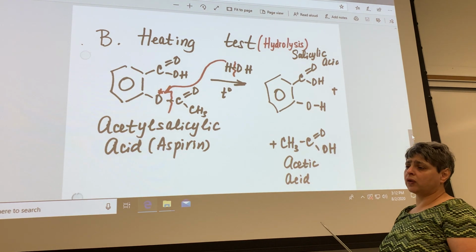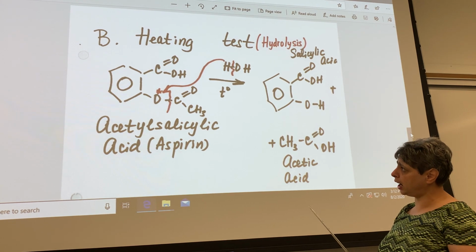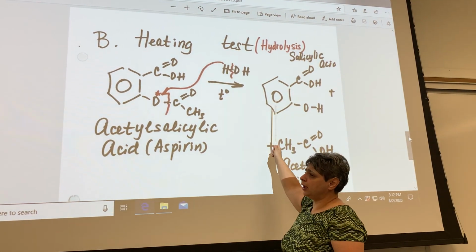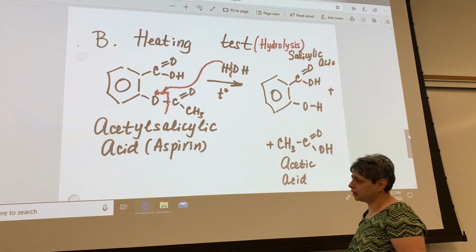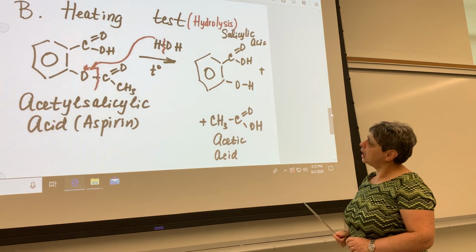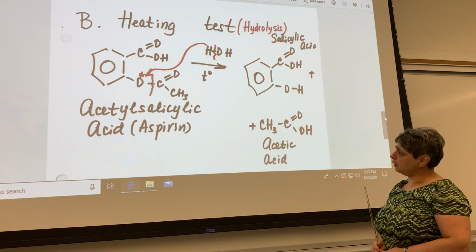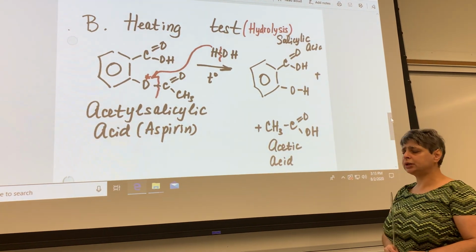Now, you typically never cover containers that are heated, but loosely covering your container here is fine, because obviously your water bath, boiling water, produces water vapor, and water vapor could enter the reaction flask and would start destroying your aspirin, hydrolyzing it on contact before you were actually even able to isolate it in the course of your reaction. And so here you hopefully now see why you were told to loosely cover the mouth of the flask while making your aspirin.